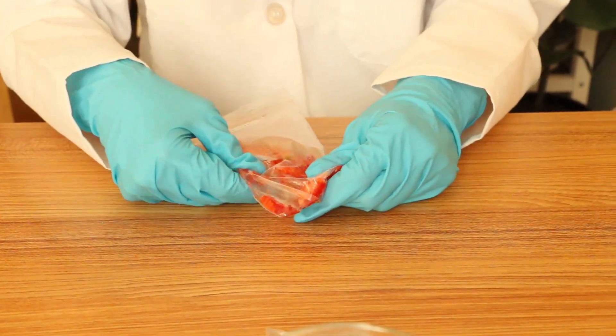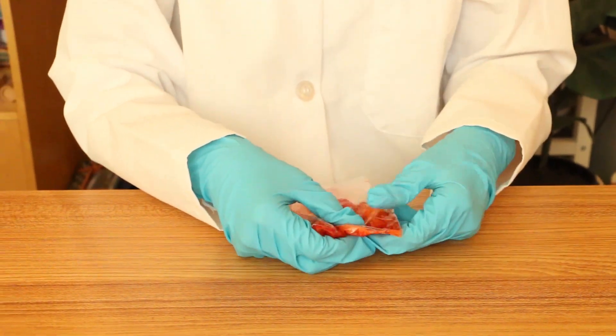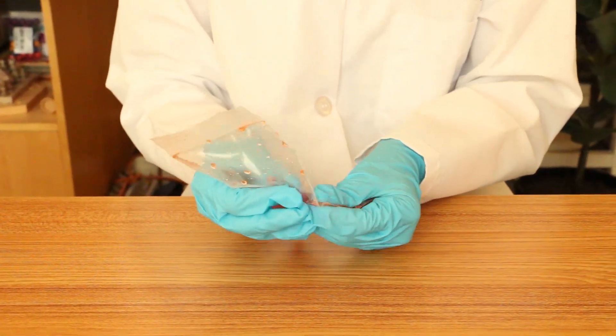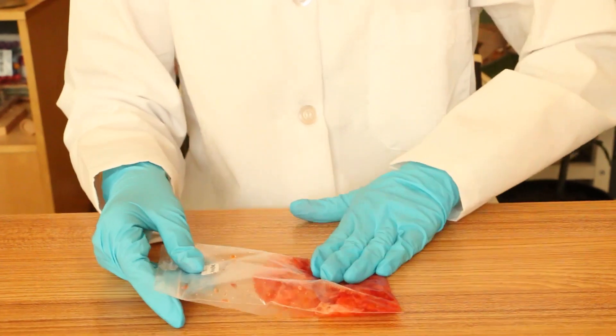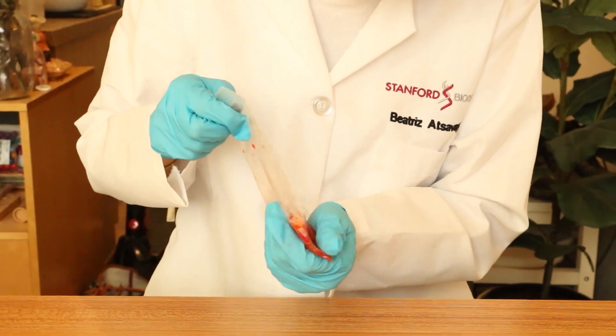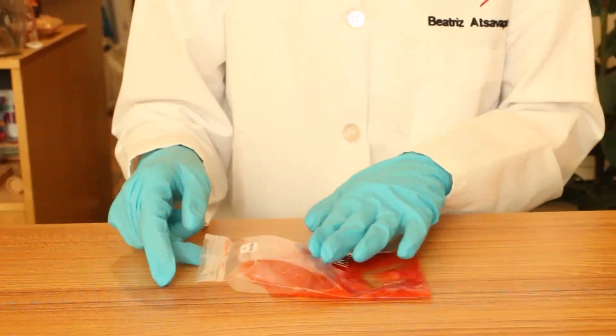We want to make sure that we don't have any lumps or clumps after we're done mashing, so we can release as much of the DNA from the cells as possible. Now we have millions of individual cells in suspension in the saline solution. While we broke down some of the cell walls just from mashing the strawberry, to break down all of them we'll need the lysis buffer.